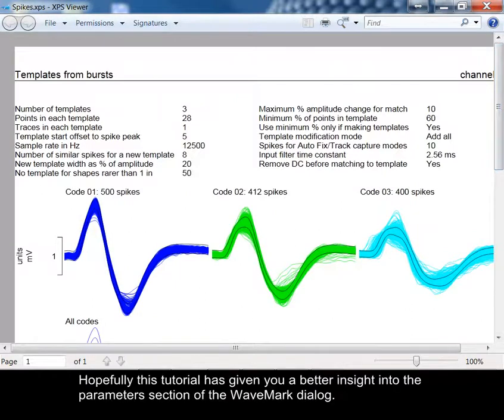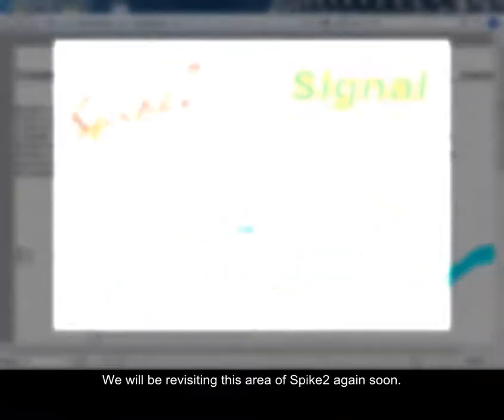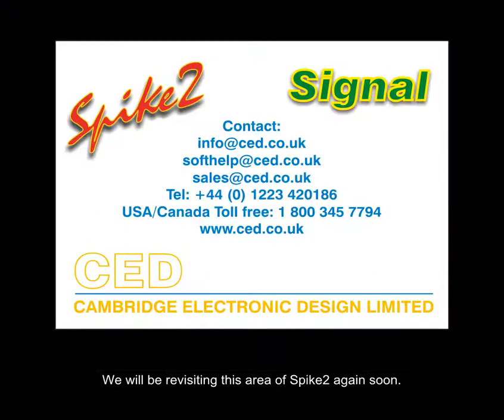Hopefully this tutorial has given you a better insight into the parameters section of the wave mark dialog. We will be revisiting this area of Spike2 again soon.